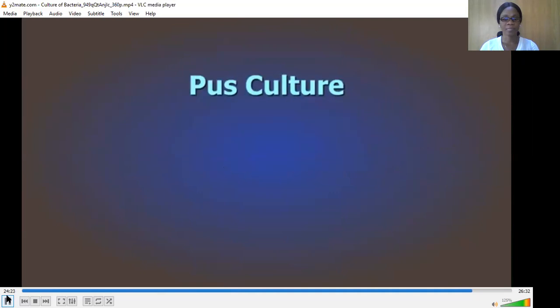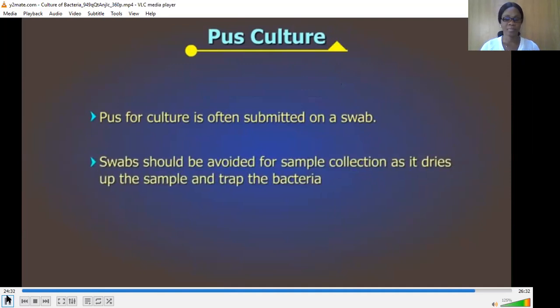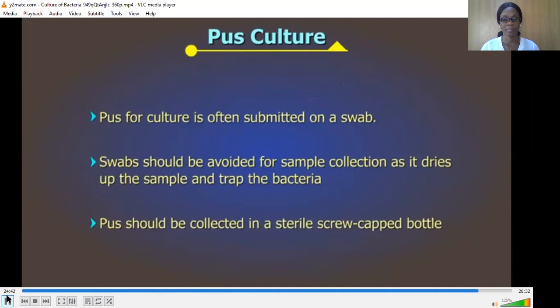Pus culture. Pus for culture is often submitted to the lab on a swab. As far as possible, swabs should be avoided for sample collection as it tends to dry up the sample and trap the bacteria, which are then not released onto the culture plate. Pus or exudate should be collected in a sterile screw cap bottle or a firmly stoppered tube or syringe.